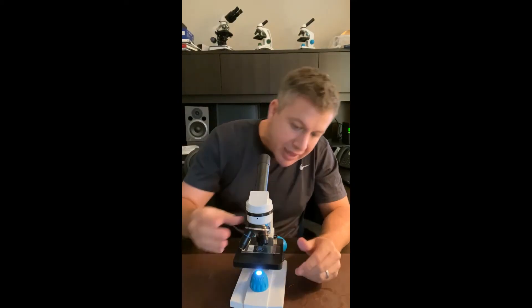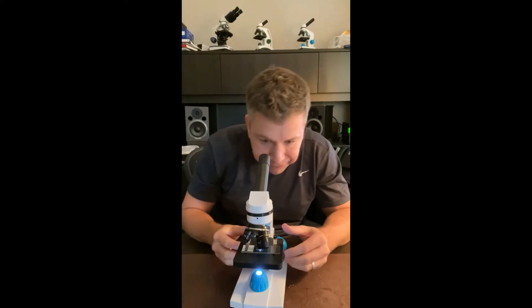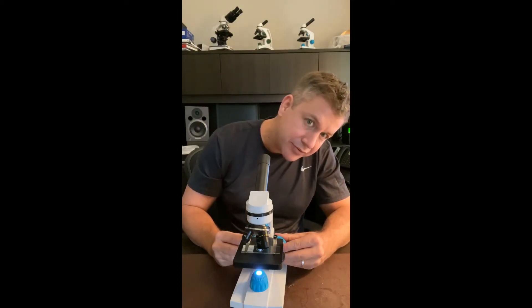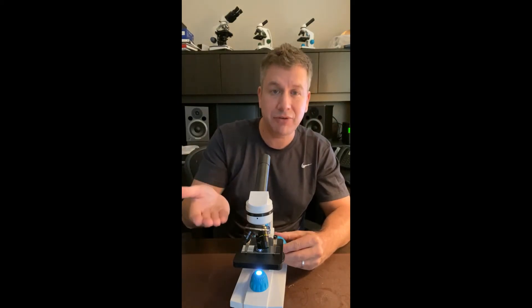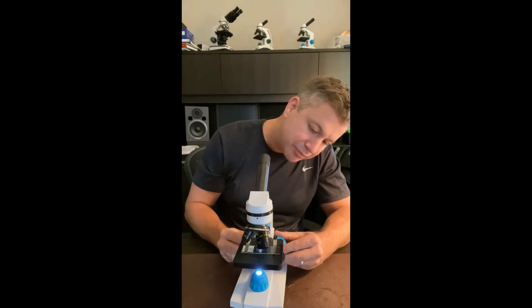There it is. And then finally, you can move to the highest objective, which is the blue one, and that gives you 400x. Now, a word of warning: when you're using the blue objective, you have to be very careful with the focus knobs, because if you raise the slide too high, it will actually crush into the bottom of the blue lens and can break the slide. So always, when you're using the blue lens, look at it from the side like this.